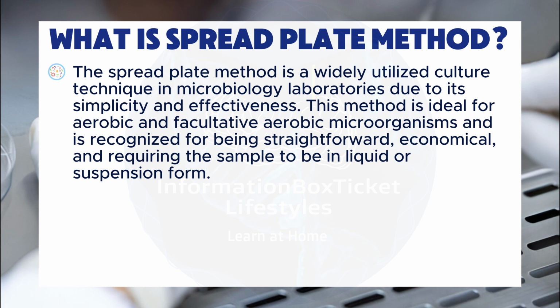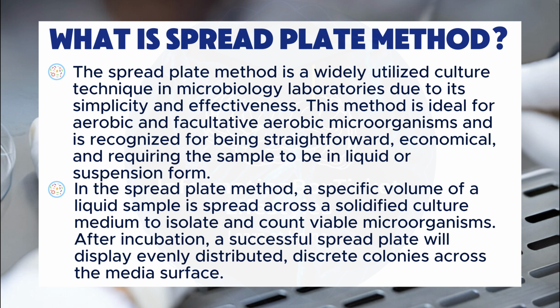The spread plate method is a widely utilized culture technique in microbiology laboratories due to its simplicity and effectiveness. This method is ideal for aerobic and facultative aerobic microorganisms and is recognized for being straightforward, economical, and requiring the sample to be in liquid or suspension form. In the spread plate method, a specific volume of a liquid sample is spread across a solidified culture medium to isolate and count viable microorganisms.